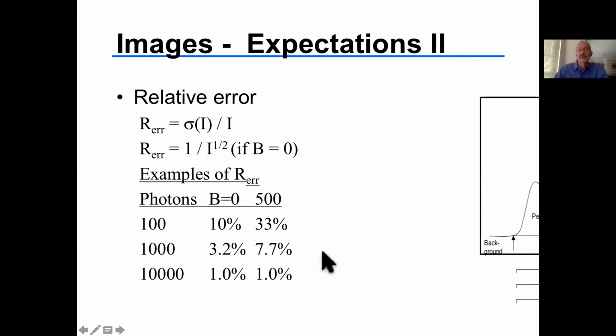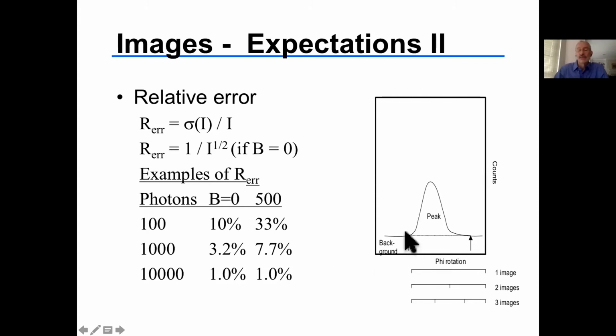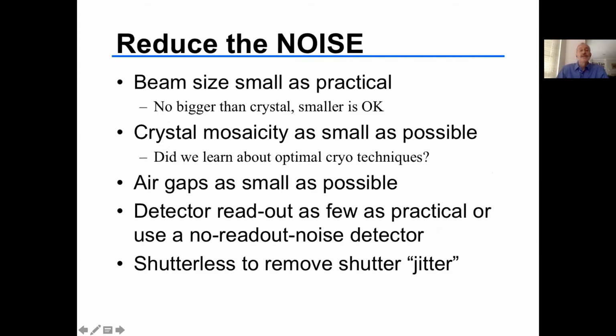As an example, if we increase the rocking curve, or the amount of angle the crystal needs to pass through the Ewald sphere, the X-ray background will increase as this curve goes from a narrow peak to a wider peak. If we just have a lot of material and ice in the sample mount, or air scatter, we can just increase the background for everything. And this would be a poor experiment. So you want to reduce that background. You want to reduce the noise.